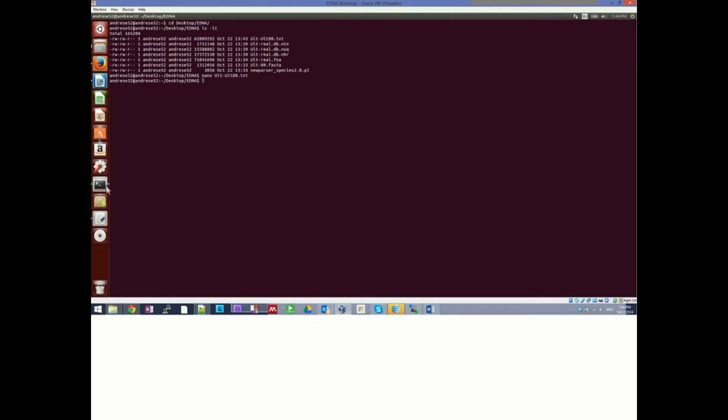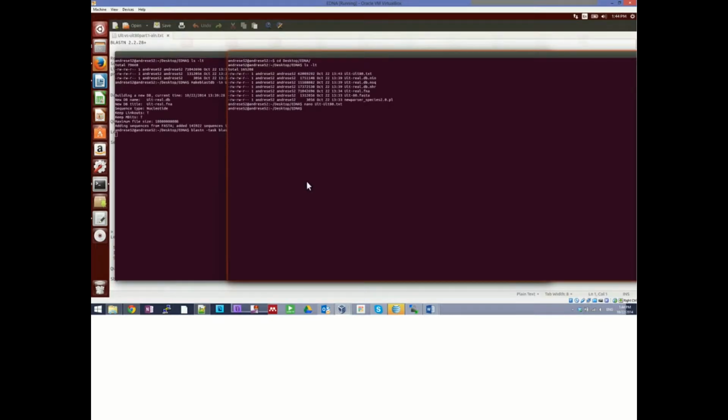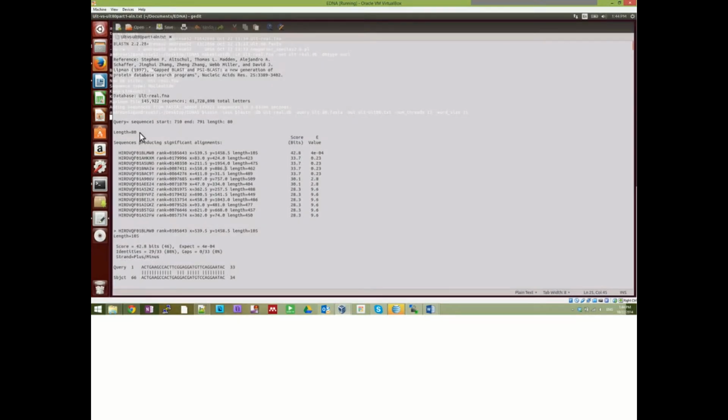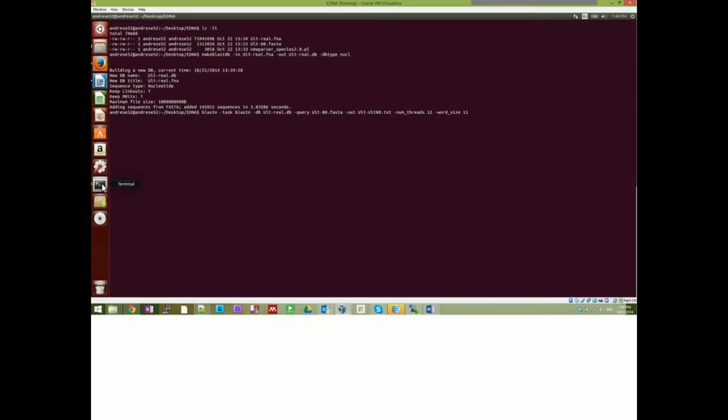So, and this is one terminal I have. The other terminal is here, still running. Like, we're having problems here. Okay, here, open. Whenever you open in the same thing in gedit, it's gonna become very slow, so it's not recommended to open it that way. It's better to open via nano. So I'm gonna close it because it's gonna get so slow. So now this one is still working, but meanwhile this works, it's gonna take around 10 minutes.